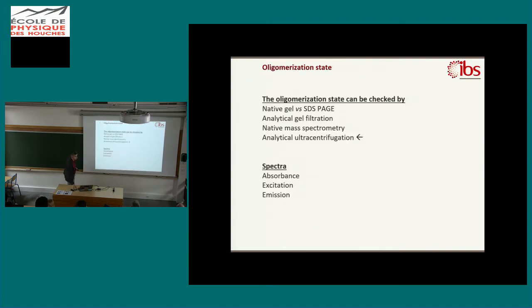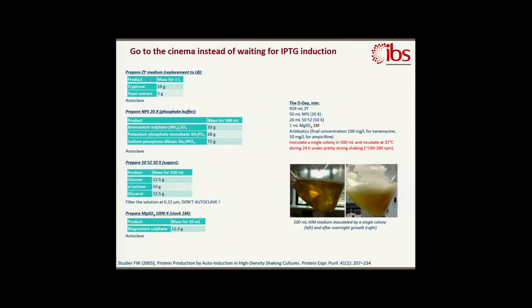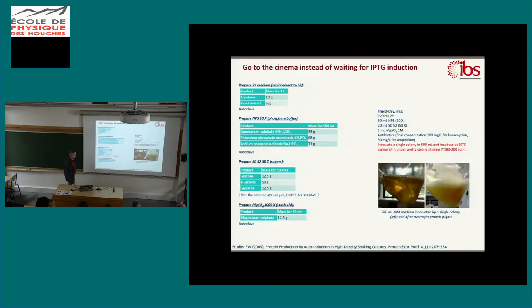It works really. Sorry. How many milligrams per liter? How many milligrams of protein? So it depends on the vector, of course. The best vector we found currently is pQE31. Which for the protein we are currently working on produces, do you remember, 300 milligrams per liter. So it works.